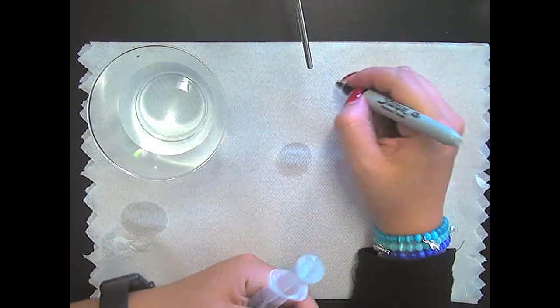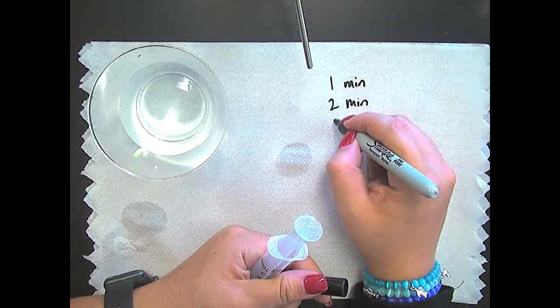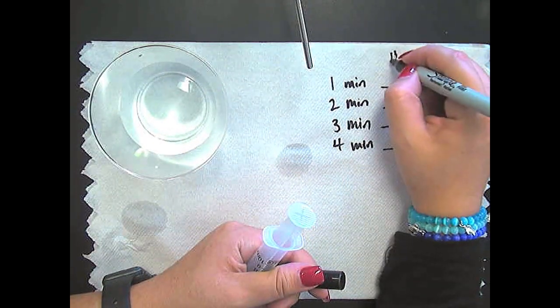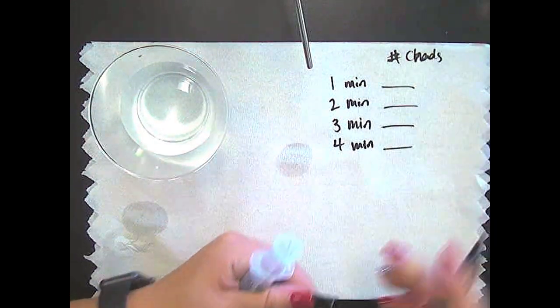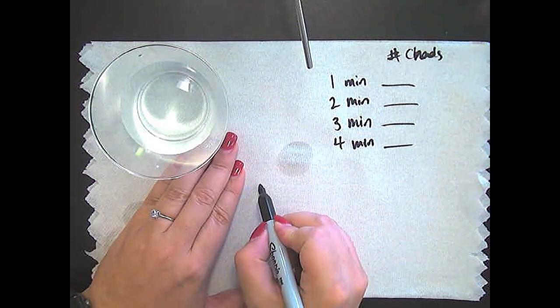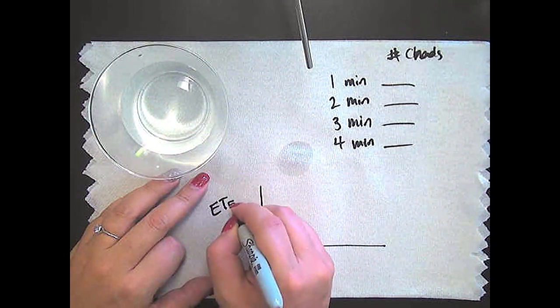of how many chads are floating at different points. I'm going to use minutes as my time points. For each of these, I'm just going to record the number of chads that are floating. After I've done this, I'm going to take that data, however long it takes, and graph it. I'm going to do a best fit line to find what is known as the ET50.